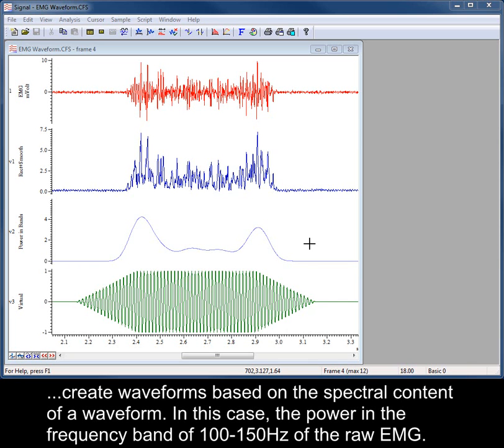Create waveforms based on the spectral content of a waveform. In this case, the power in the frequency band of 100 to 150 Hz of the raw EMG.